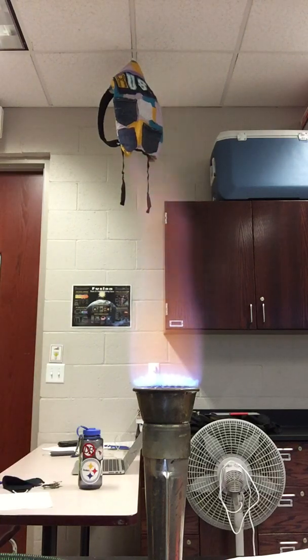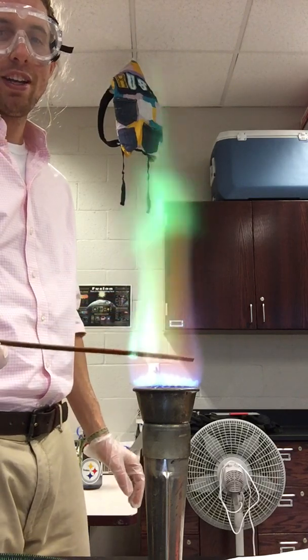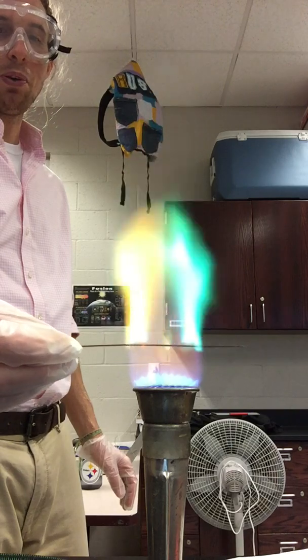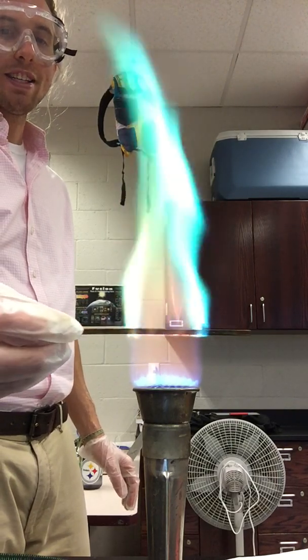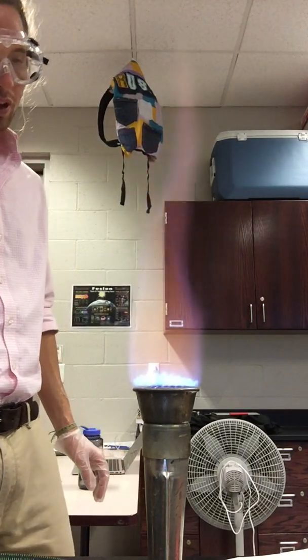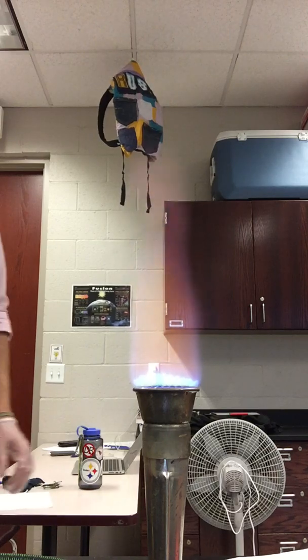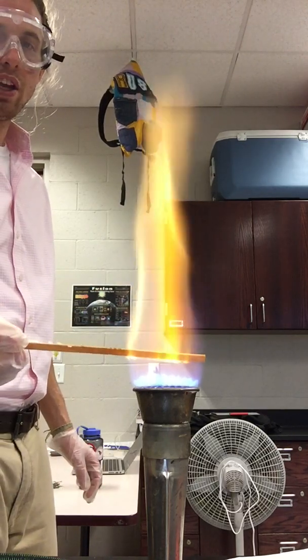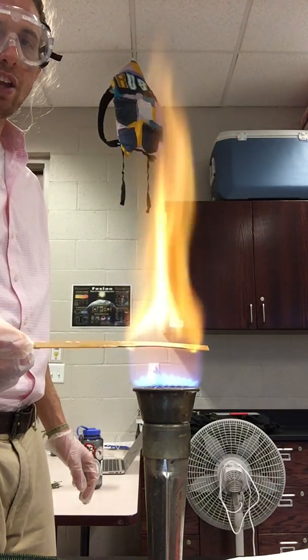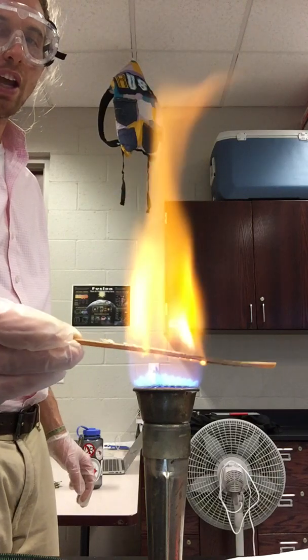Here comes number 4. Number 4 is everyone's favorite, including my own. We've got like a Wizard of Oz type of situation here, right? We've got the green emerald flames, and that is sample number 4 that we are burning here. Sample number 5 looks like this. Remember we had a gold one. I know it's tough on the iPad video, but this one's a little bit more yellowish in color, so kind of like a pale yellow you can see in number 5.